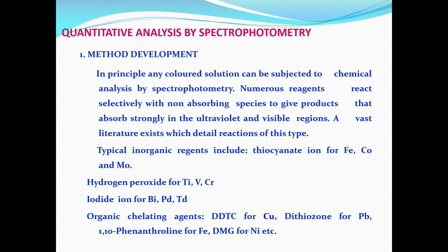There are certain elements like hydrogen, helium, neon, argon, krypton and several other gases for which there are not many spectrophotometric reagents. Oxygen, nitrogen, you do not need a spectrophotometer for that. There are not many methods for the determination of these gases. But if it is a metal ion, a semi-metalloid, an organic compound, or a biochemical compound, you will find a number of analytical methods for the determination of such analytes.